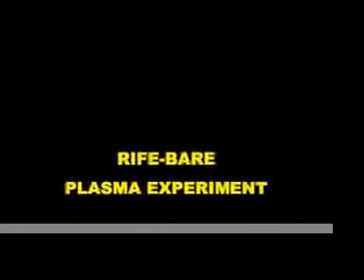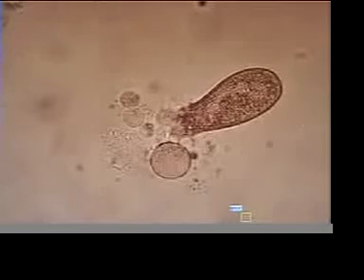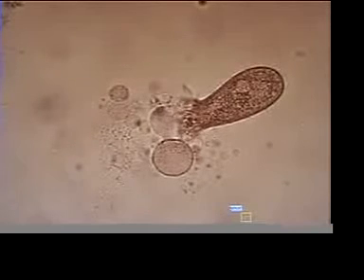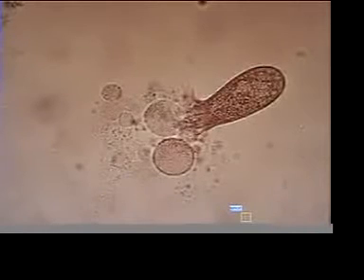October 7th. Disintegration of a Blepharisma in real time with a pulsed radio frequency plasma device.